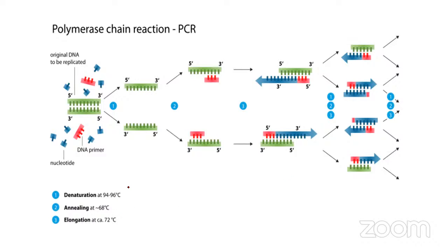So it takes place in about 3 stages. Stage 1 is what you call denaturing. And I've used the last figure that I have to show you how a DNA with double strands can be heated and it becomes denatured. So denaturing in PCR takes place at about 94 to 96 degrees centigrade. In that case, you have a DNA in your clinical sample, which you've extracted, you heat it up, it separates.